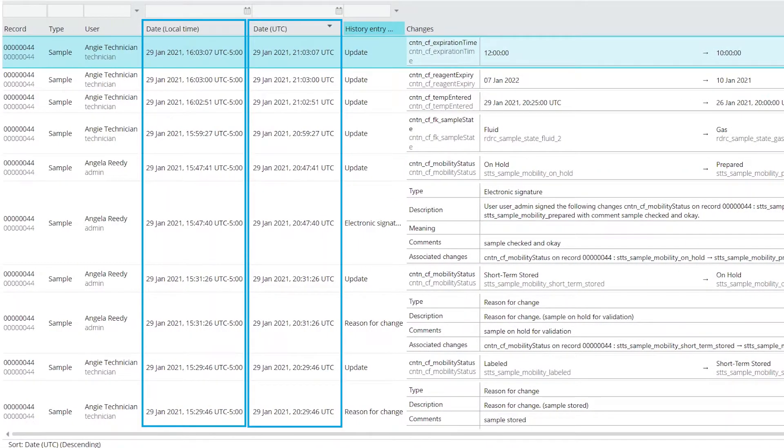History grids split into two columns to show when the change occurred in the user's time zone and in UTC time. These respect the history date format lab setting.